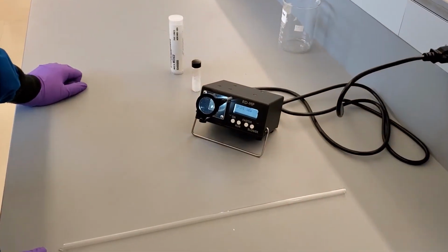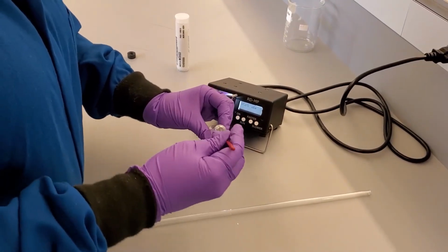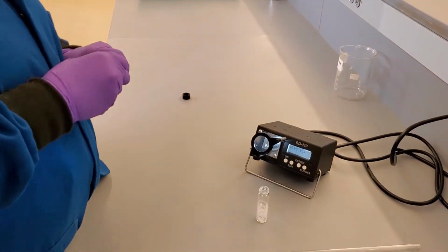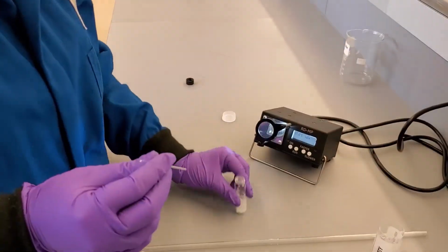Now we will take the melting point of our product. Turn on the melt temp. Our product is stuck to the glass product vial, so we need to scrape it off with a spatula. Obtain a new capillary tube and tap the open end on the product until you get 2 to 3 millimeters of product at the top.